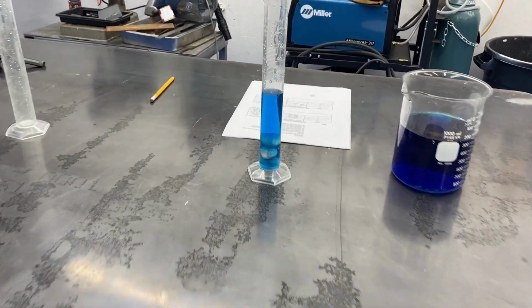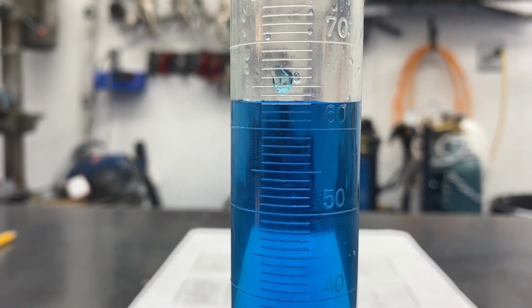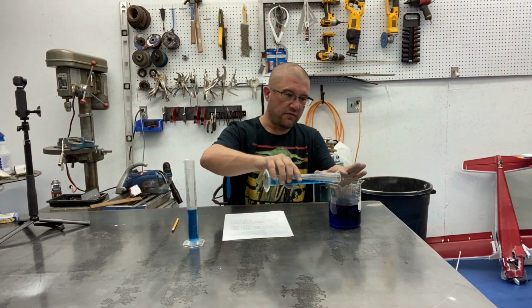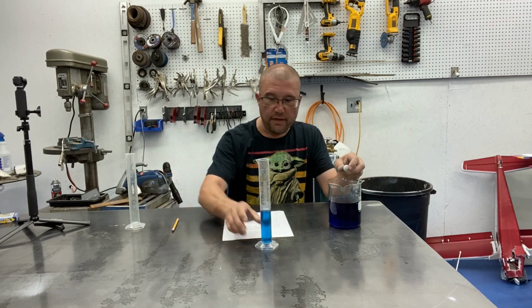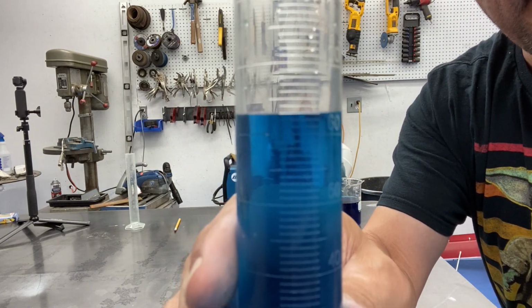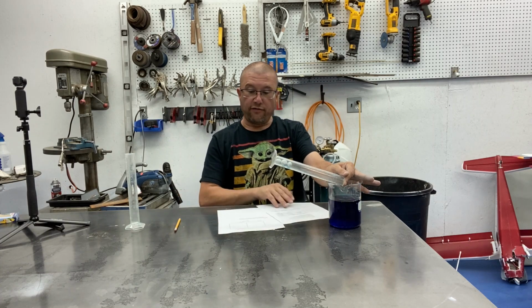Test 2, trial 2. There's our 3 spheres in the bottom, and we are at 61 to 63 milliliters. So again, nothing has changed. So now that we've recorded our data for trial 2, I'm going to dump out our spheres in our water, and we're going to do our final trial. Again, 63 milliliters. Record that information in your data table and then move on to the third and final page of the lab.